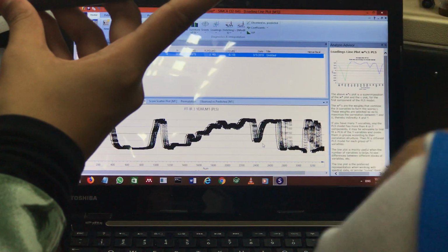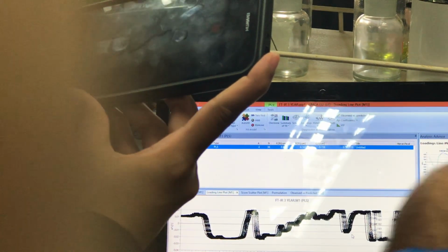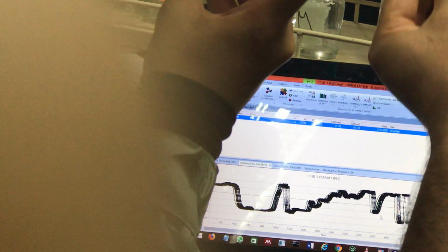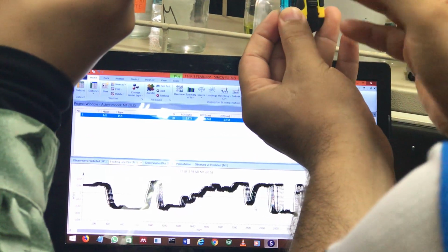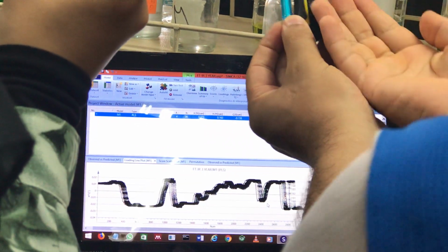How many different components? This is the first information you will get from the software. Components meaning, I will tell you easier, let's see if it gives you 3 components, 4 components, 5 components. I will ask the first student to give me the difference between these two things. Let's see, our sister tells 50% of the differences between these 2 pens. I will ask the second sister, come. I told her already. This sister tells me this. Give me others. She will tell me 10%.